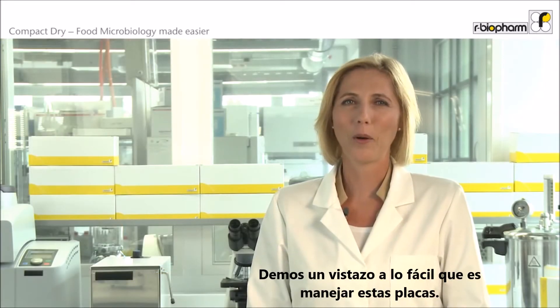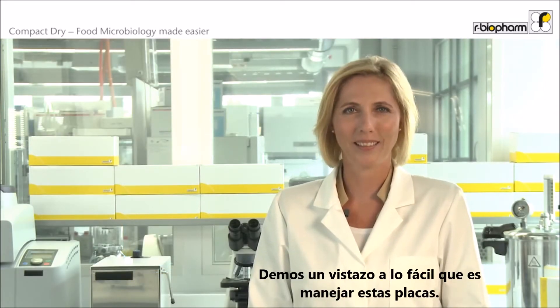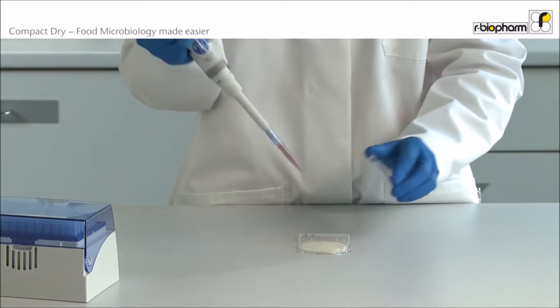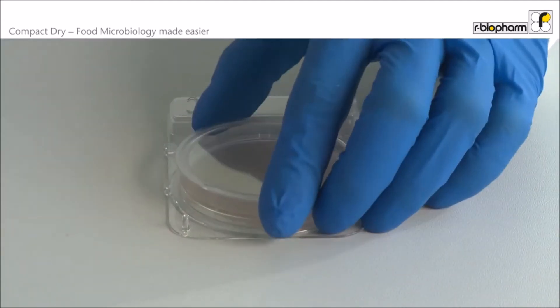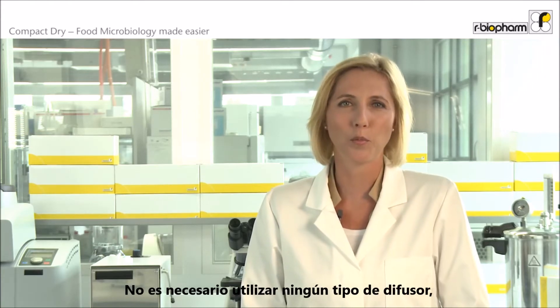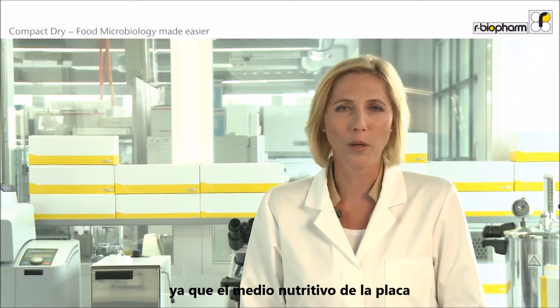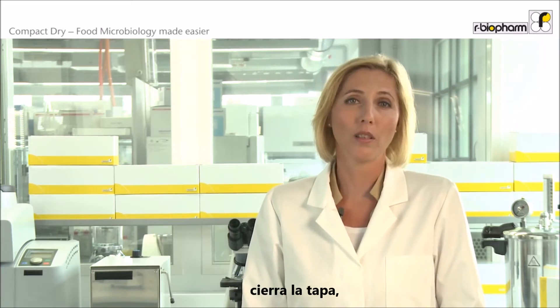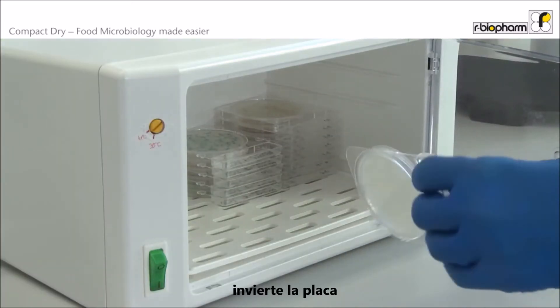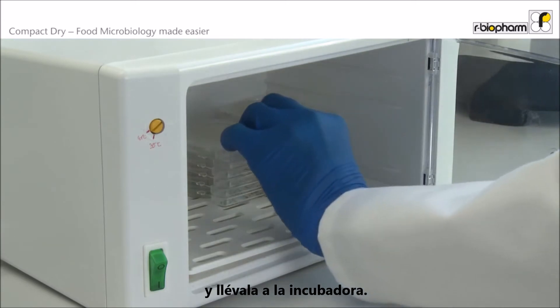Let us have a look at how easy these plates are to handle: open lid, spread sample liquid, close — finished. There is no need for any kind of spreader or other spreading tools, as the nutrient pad of Compact Dry allows the sample to spread by itself. Once you have applied the sample, close the lid, turn it around and put it in the incubator.